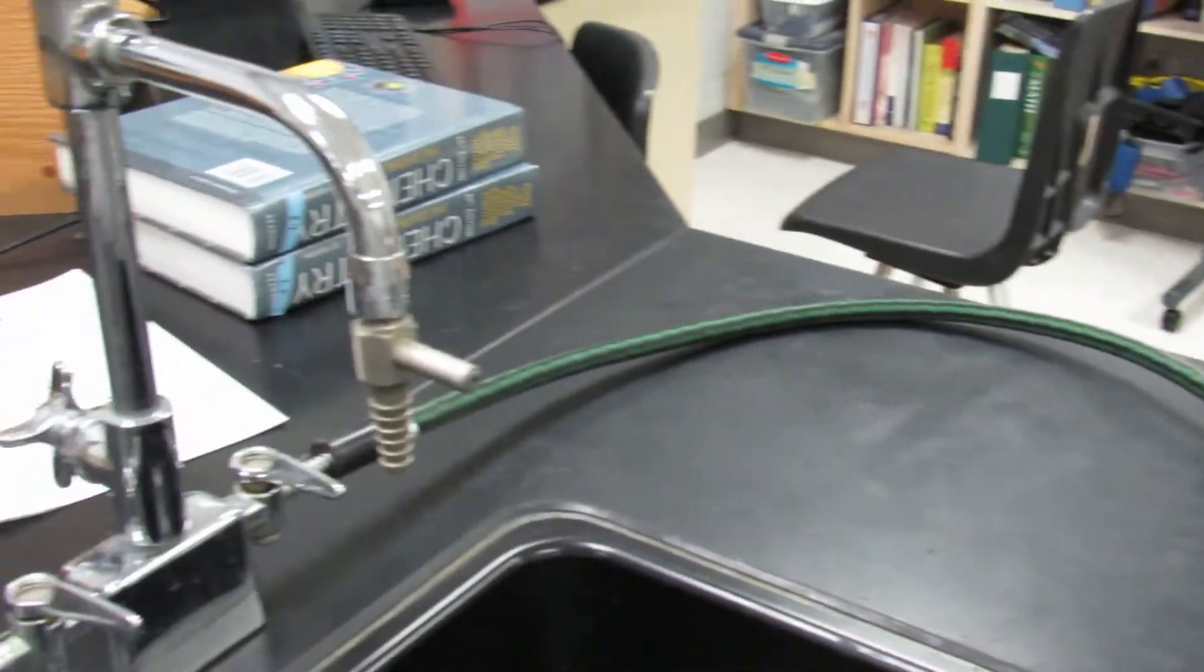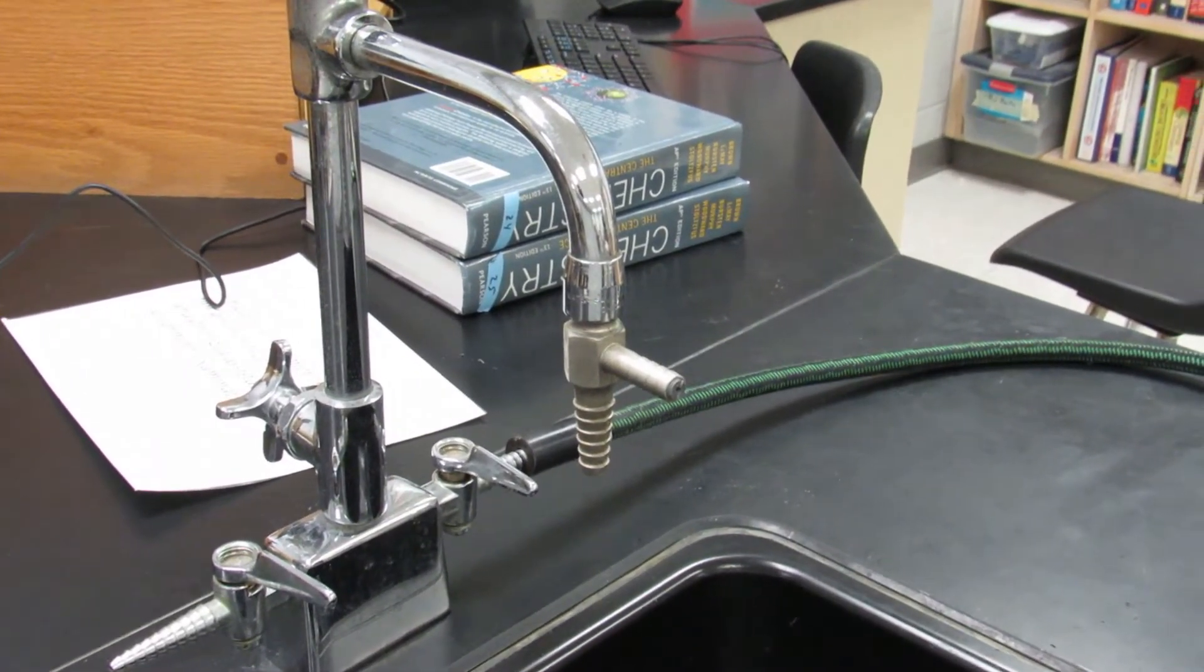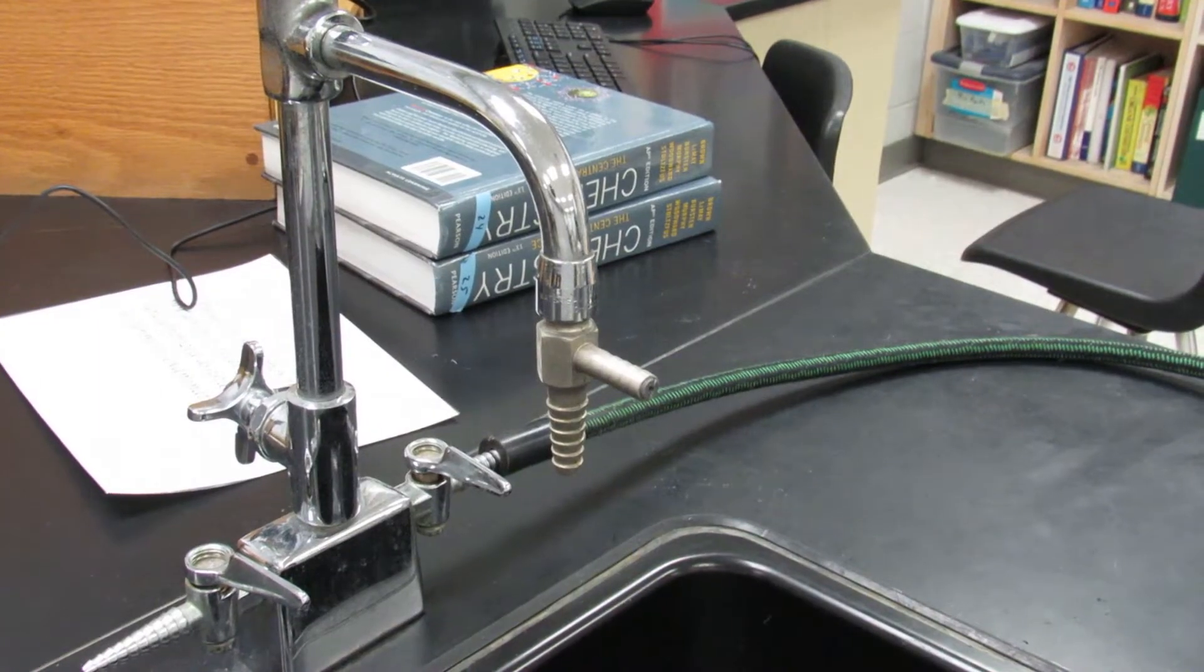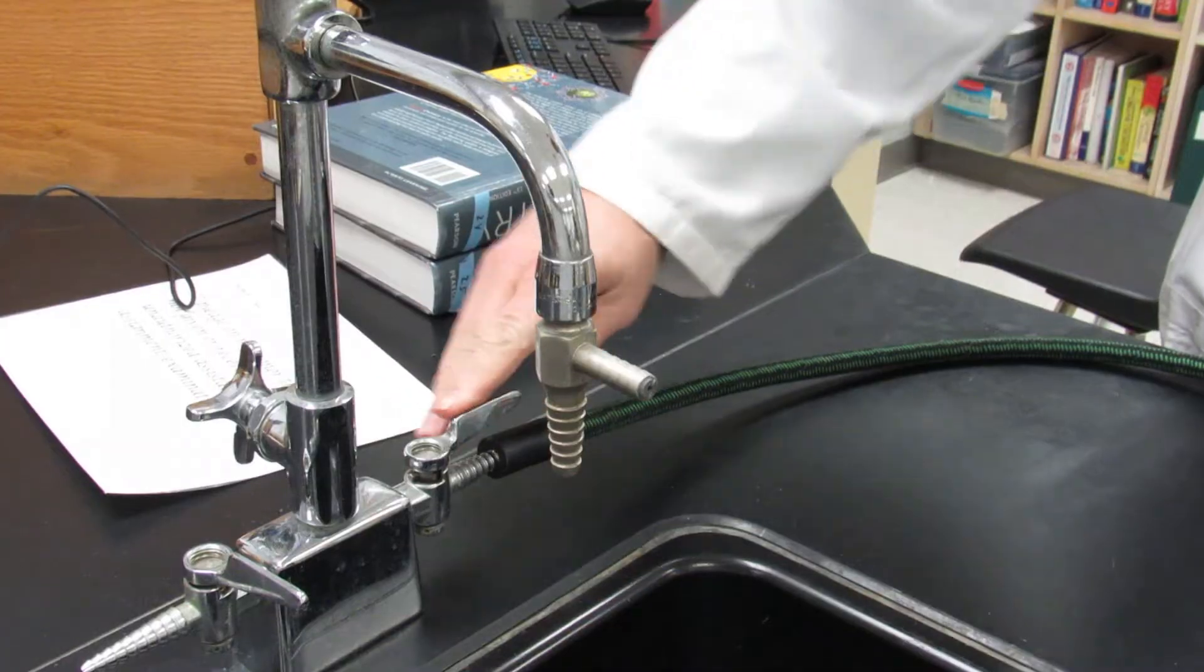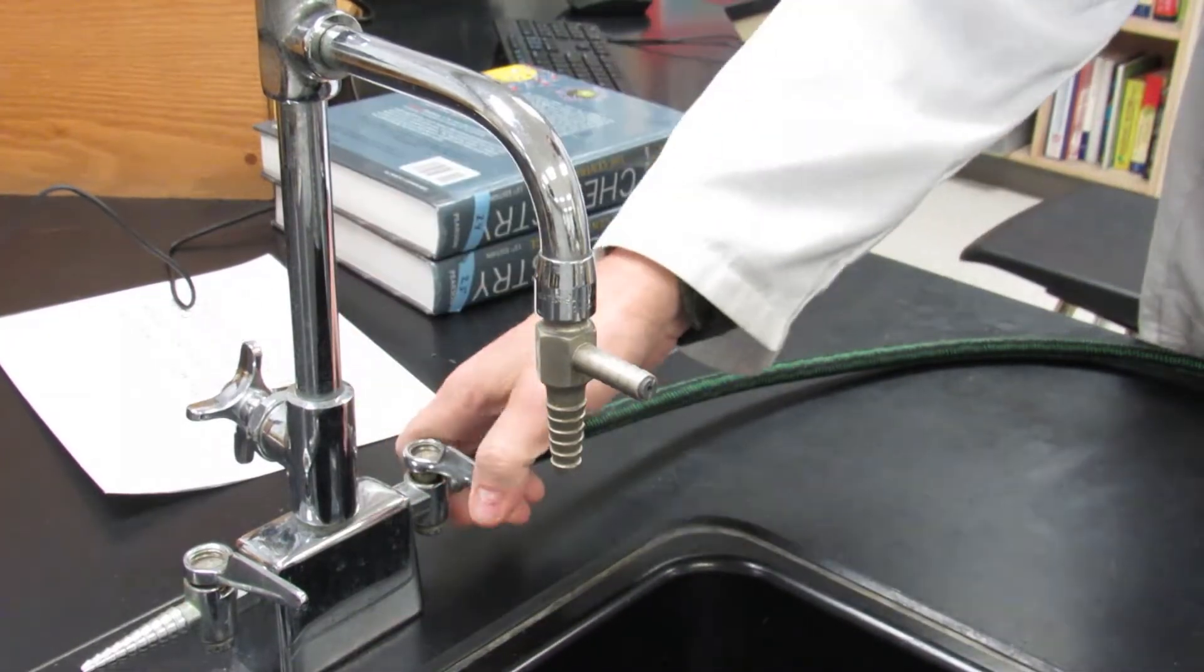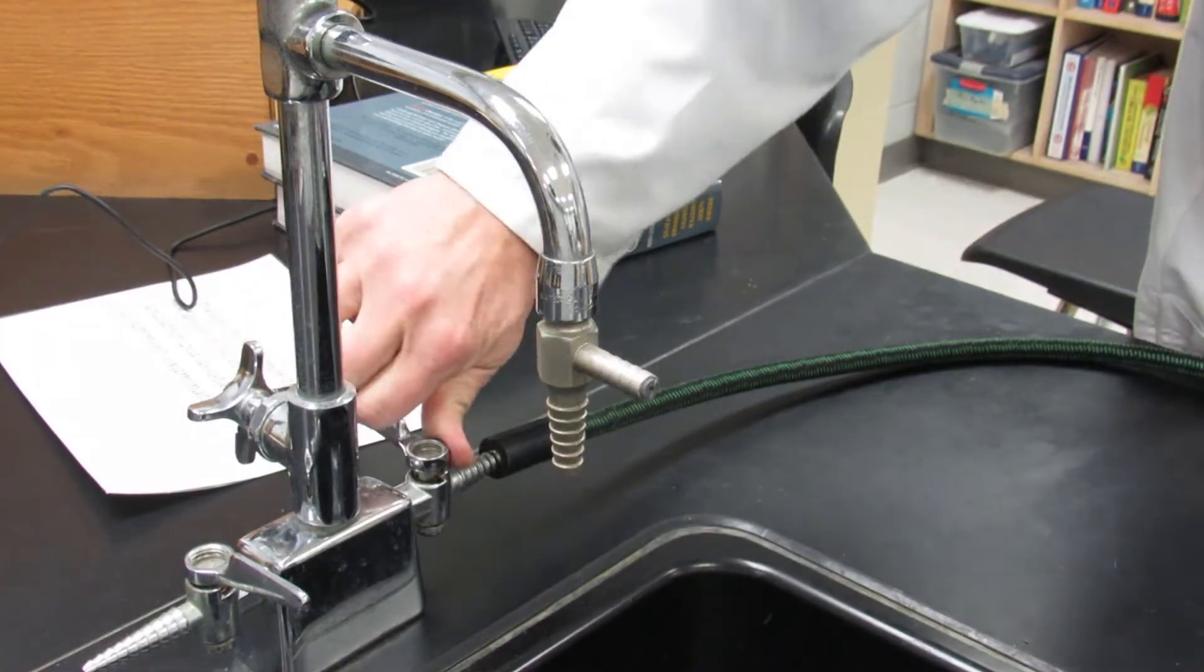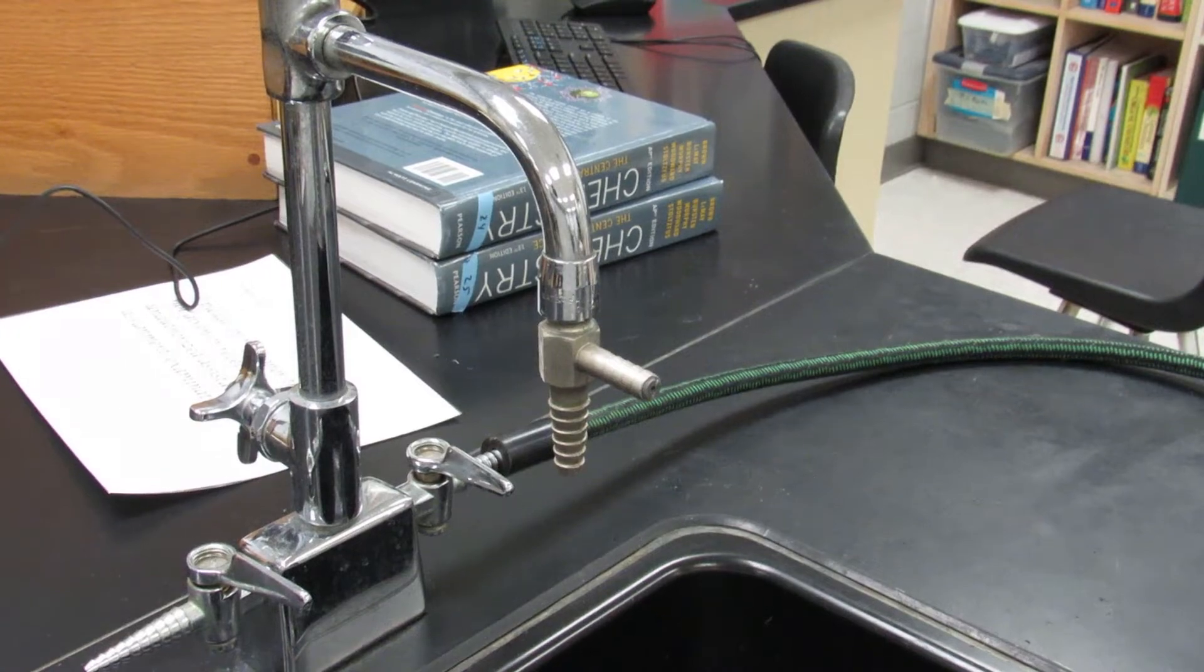The other end of the Bunsen burner is attached to a gas jet next to the sink. The valve that controls the gas is perpendicular to the gas jet when it's off, but when it's parallel, it's on.